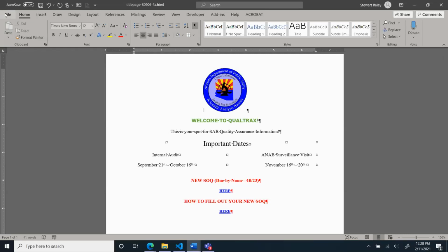I believe there are instructions in the help manual, but the Qualtrax support site also provided good instructions when I was trying to figure this all out for Word documents. Thank you. We can provide a link to the support portal, which has more information on it, and we can also provide some information from Qualtrax on this. There is information in the help guide as well. If you want more information, let us know, and we can reach out to those of you who are interested after this.